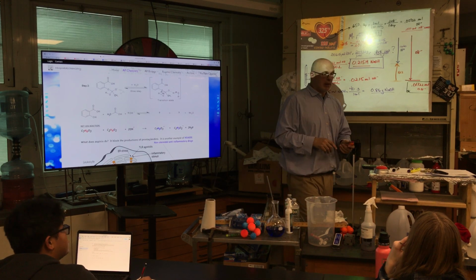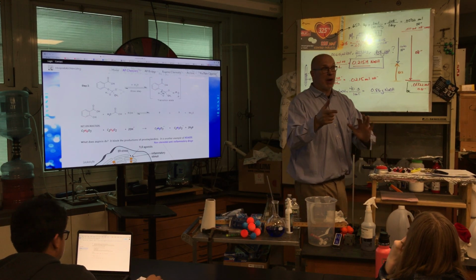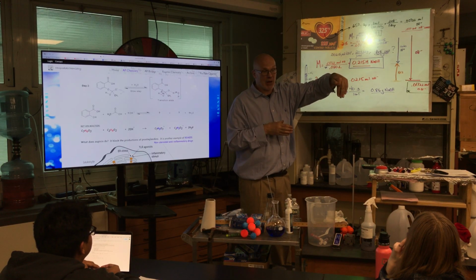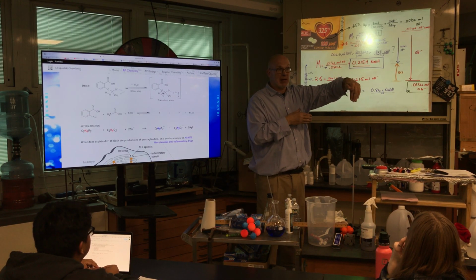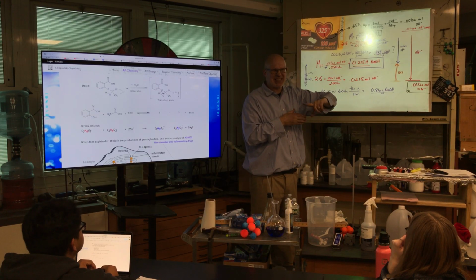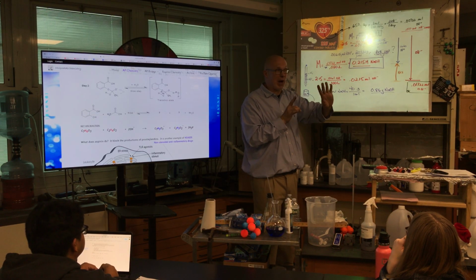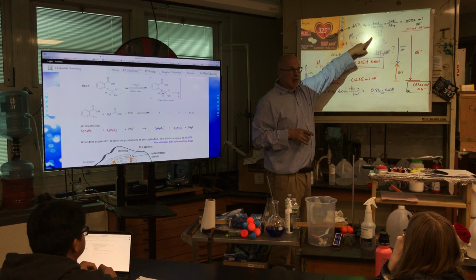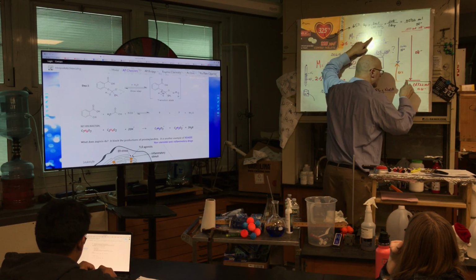Now that you know the new molarity, just like last night's form, you drop base on ibuprofen. Ibuprofen was an acid. You projected how much base, but then you had to standardize and correct. Watch. Once I know the exact molarity, what changes?